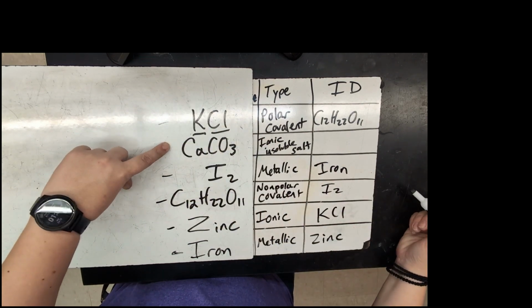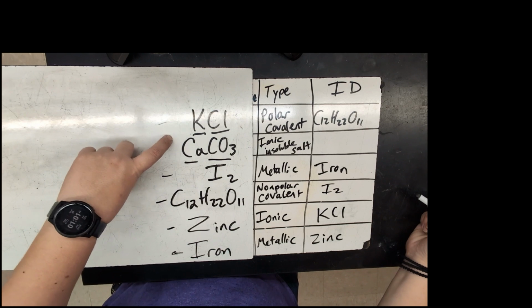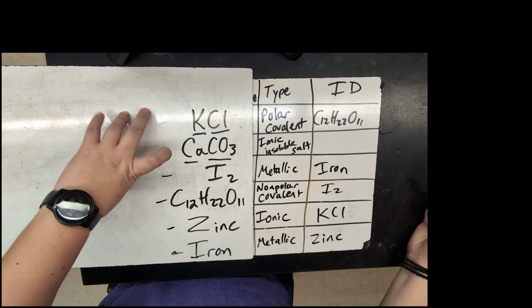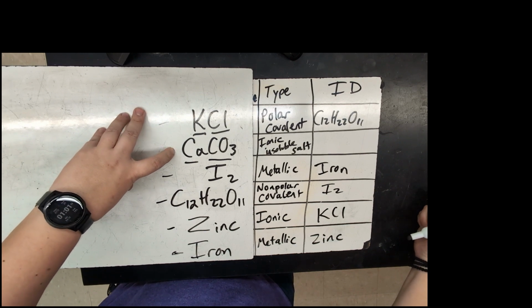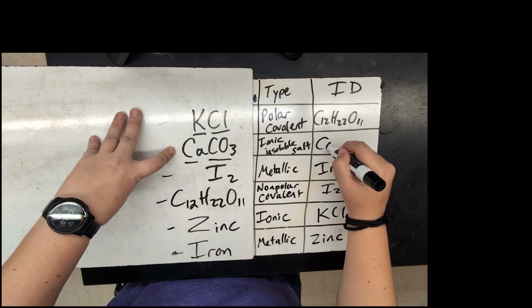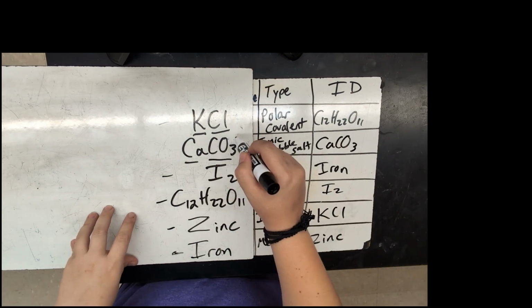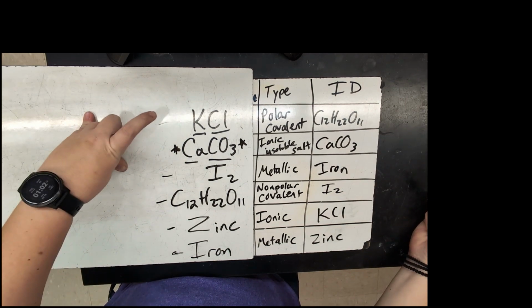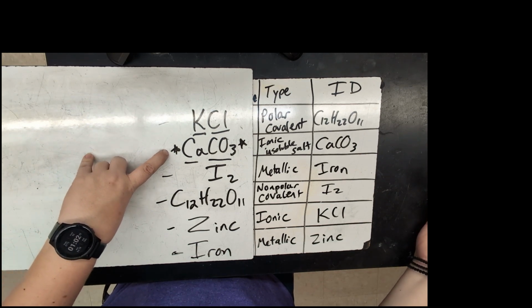Calcium carbonate, our last but not least, is an ionic compound, metal and non-metals, but it is not one of those fully soluble salts. It does dissolve a tiny bit, but not enough that we can see the conductivity in water. So typically this will form a precipitate, and it's one of those insoluble salts, calcium carbonate. I like picking these ones for a couple of reasons, because calcium carbonate in particular, having that insoluble salt, shows that ionic compounds don't always follow the rules, right? They're not 100% soluble in water. They don't 100% conduct electricity in water.